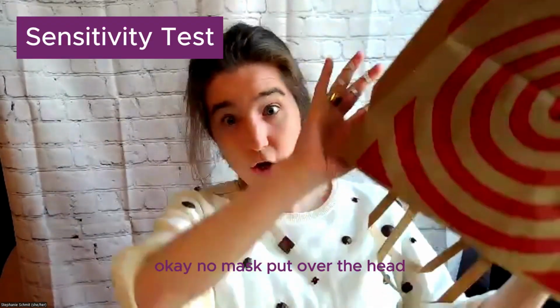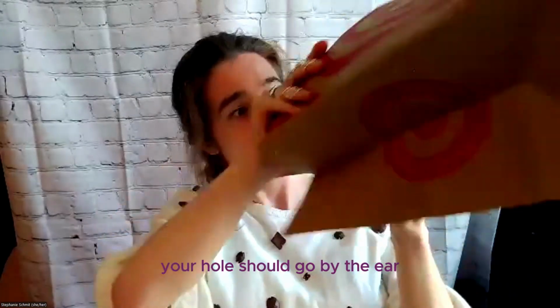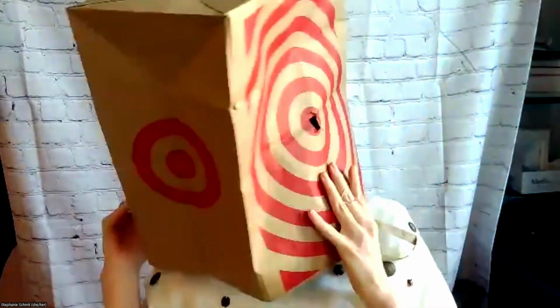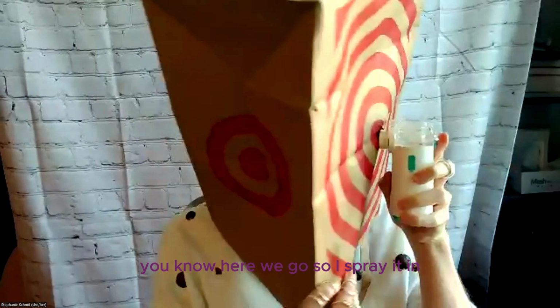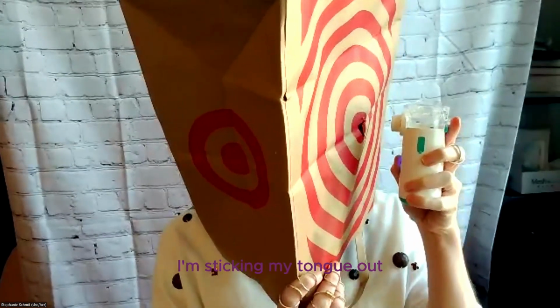Okay, no mask, hood over the head. Your hole should go by the ear. But I want to be able to see the hole. Easier with two people, but here we go. So I spray it in. I'm sticking my tongue out.